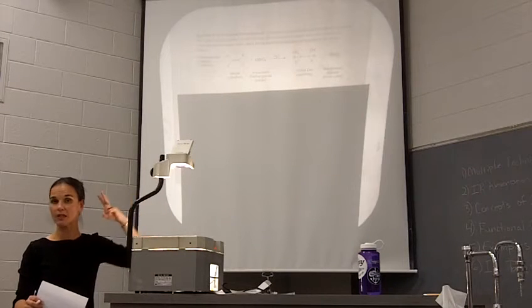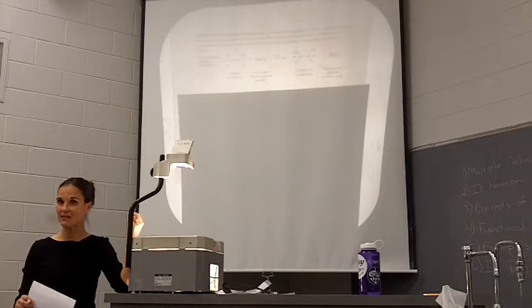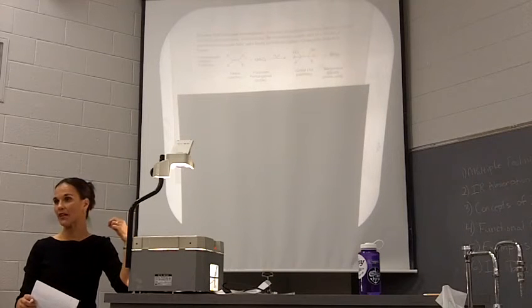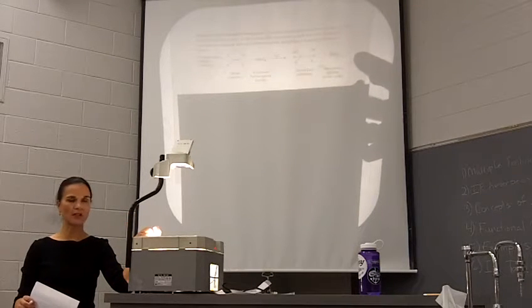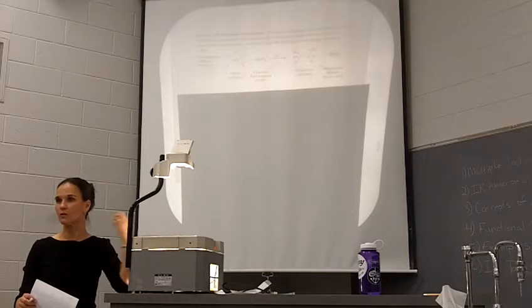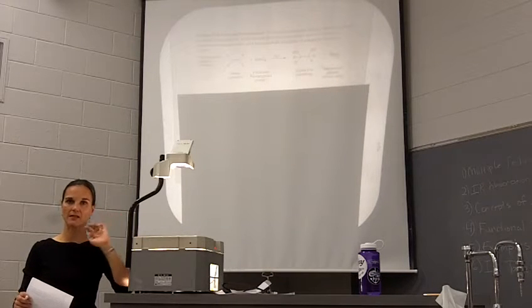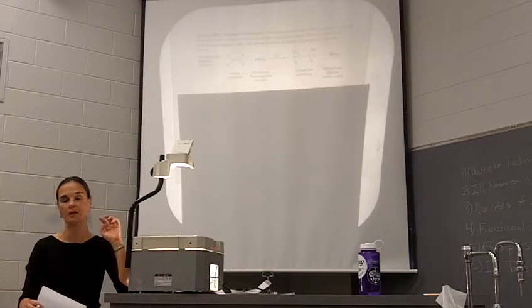So for the alkenes, you need both bromine and potassium permanganate to be positive to say that you have an alkene. And this test, you want to give it about 3 to 5 minutes, more probably about 5 minutes for it to react. So don't just sit there waiting for something to happen. Add the potassium permanganate, set it to the side, and then come back in a few minutes and look at it.